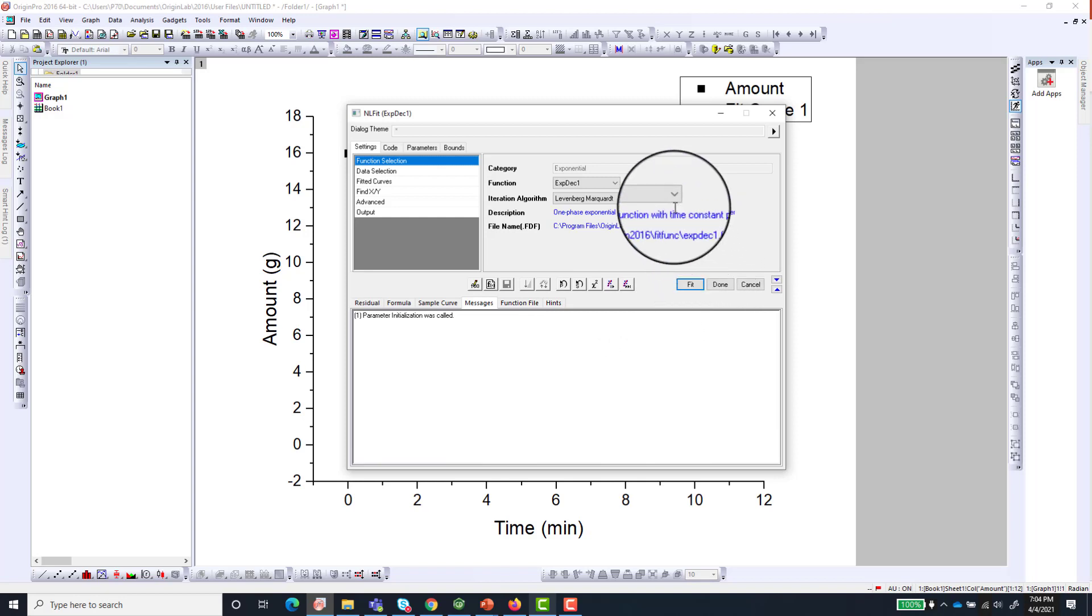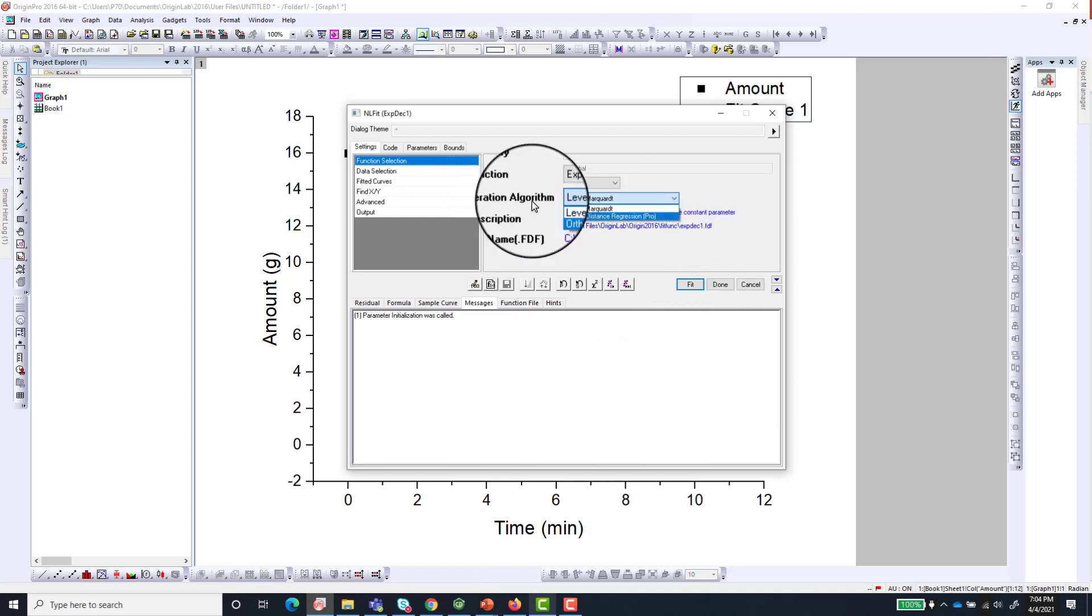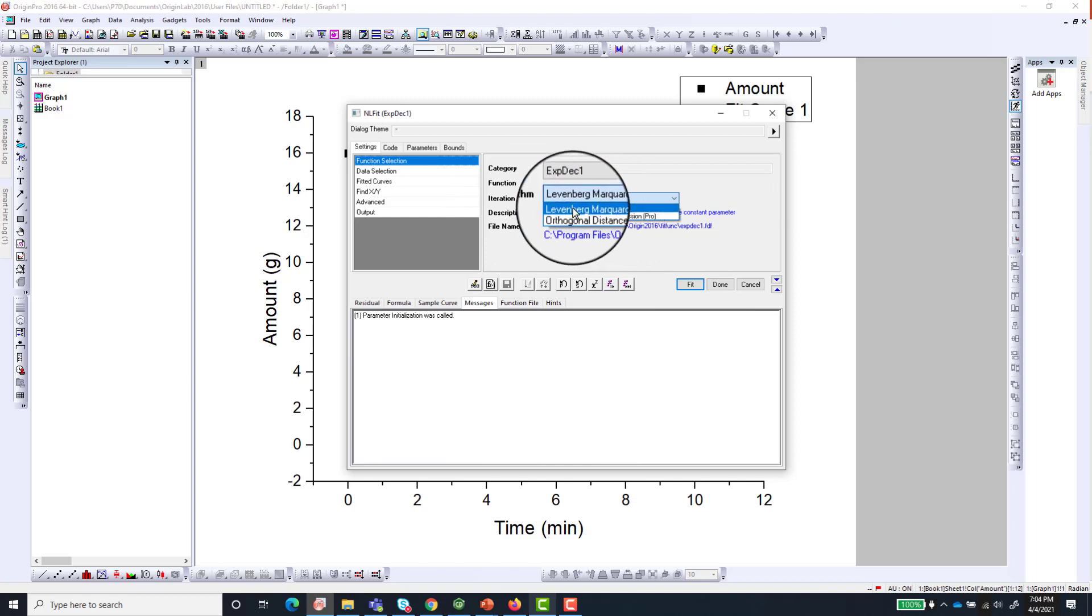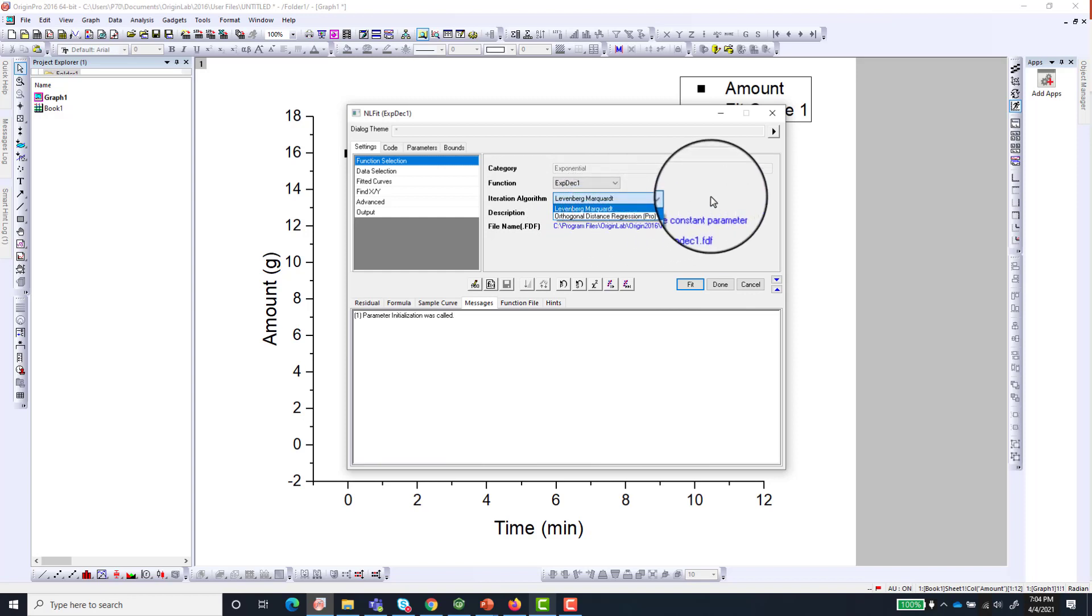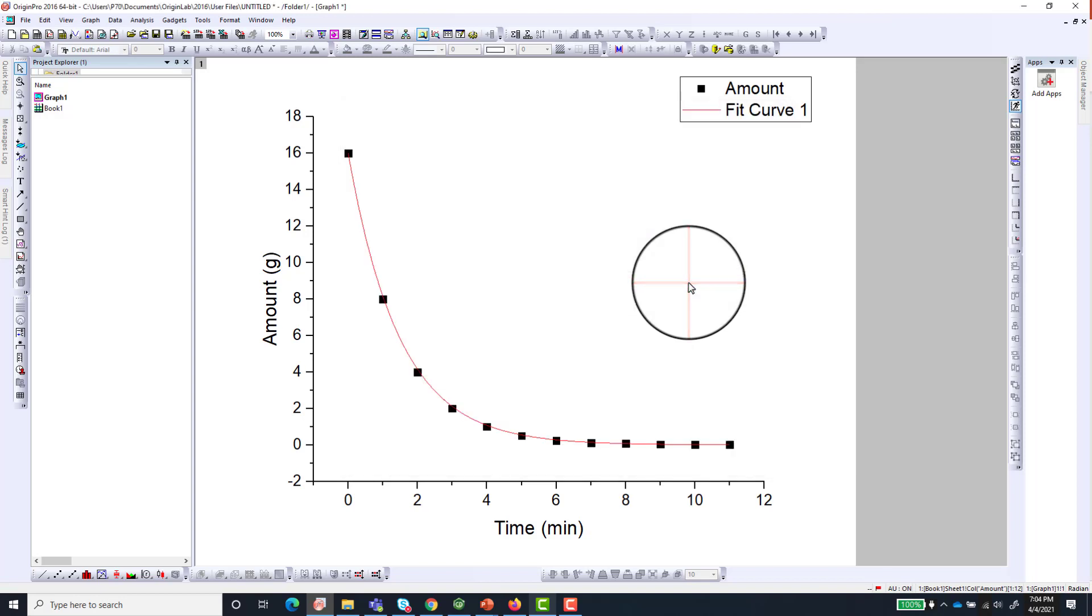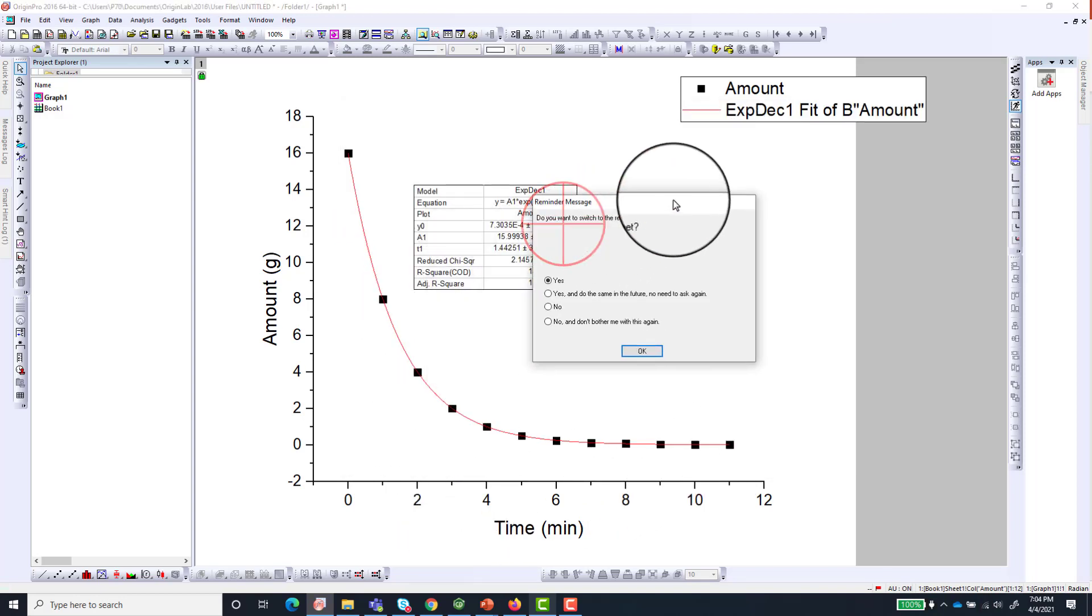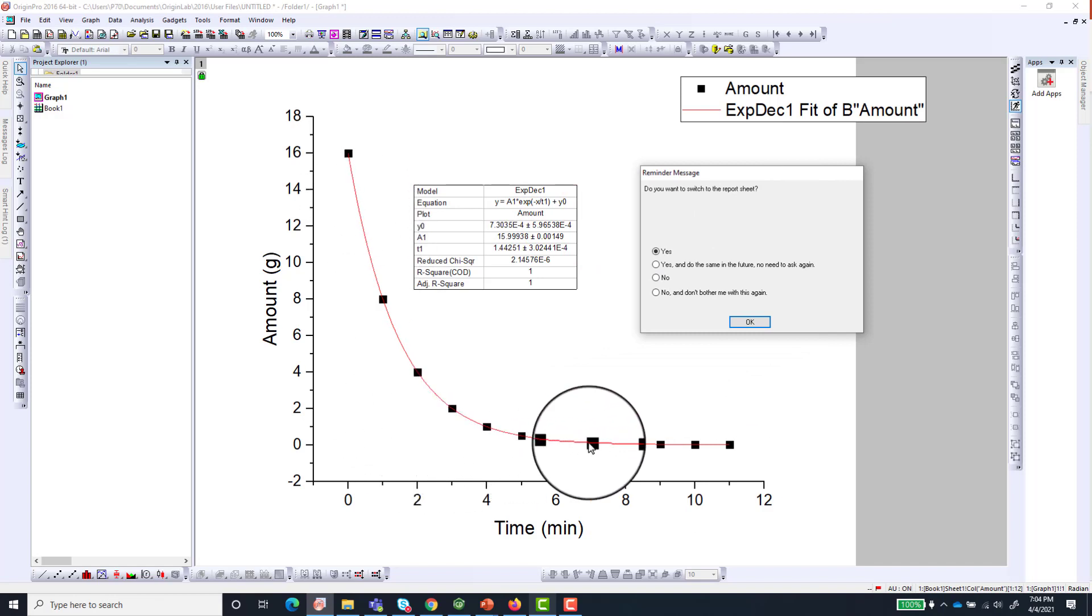And then you can also choose the algorithm that you want to use for your fit. But I usually just go with the default which is the Levenberg-Marquardt iteration algorithm. So just click Fit. And here we have our data perfectly fitted to an exponential decay.